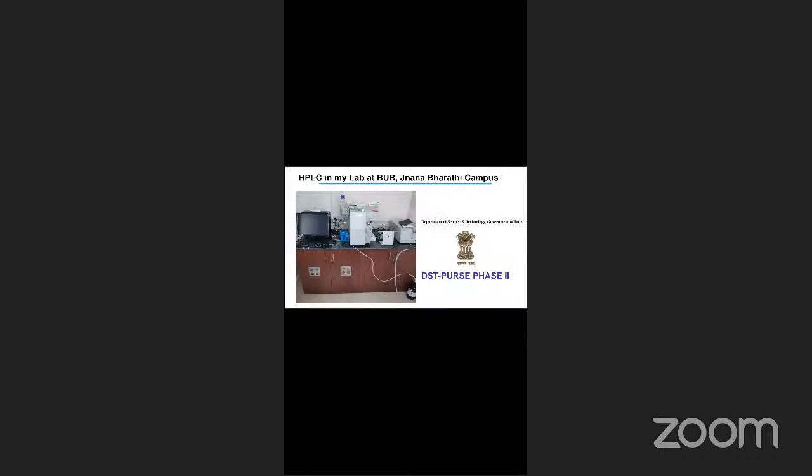Finally, I would just end with what I have in my lab. I also have an HPLC that I'm using, but mine is mostly UV based. And this was funded by DST PURSE phase two. I think it is not too relevant to talk here, but I'm just mentioning something that I use in my lab and that is being used almost everywhere. And my system is much more primitive in the way that we have been doing. With that, I'll just end and we can have a question answer session.